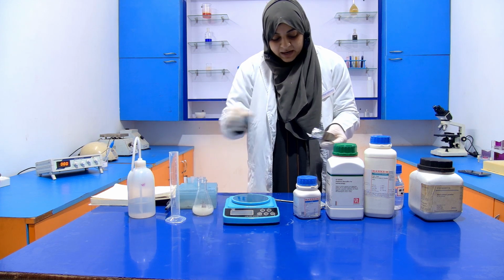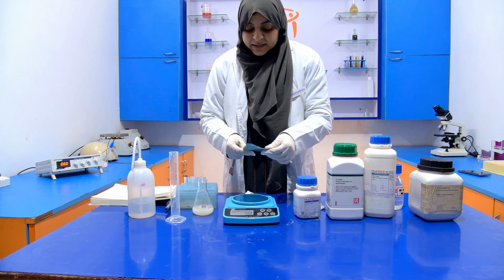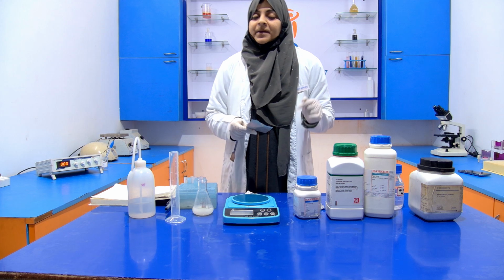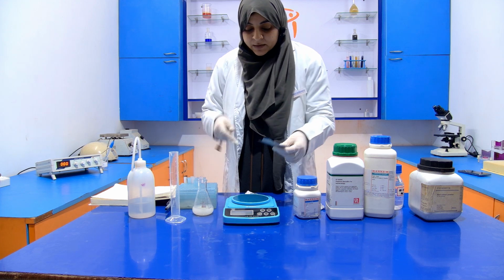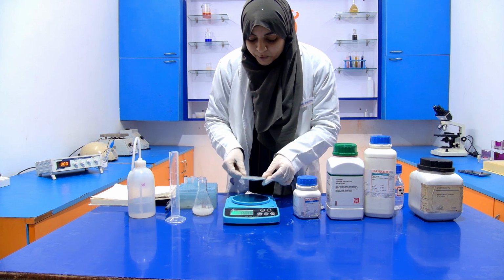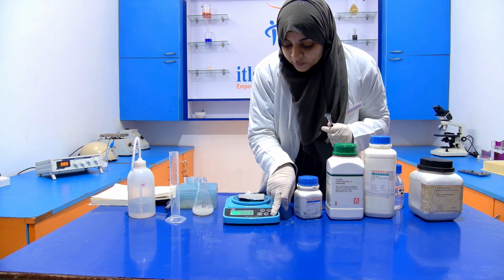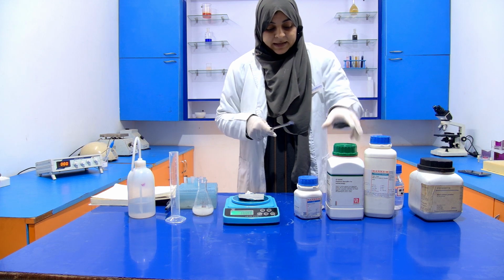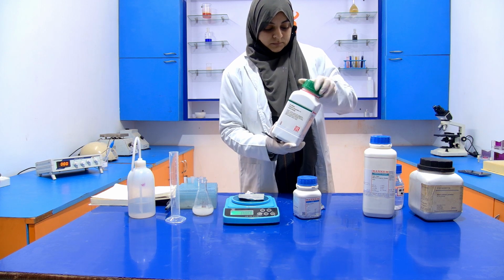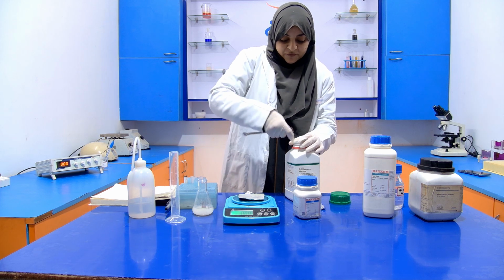Then after that we have to add another ingredient, that is your peptone. But the amount of peptone is only 0.5 gram because we are preparing it for 100 ml. Again, we switch on the weighing balance, put aluminum foil on it. Now tare the weight of the aluminum foil. Then after that, I am going to add the peptone. The weight of the peptone should be 0.5 gram.